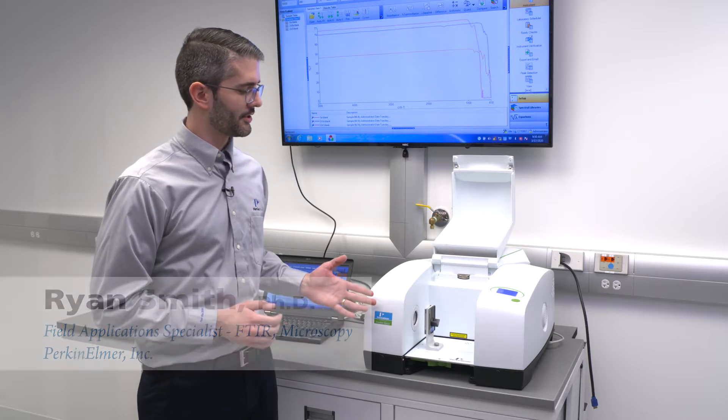Hello, my name is Ryan Smith and I'm an application scientist with Perkin Elmer. Today we're going to talk about the Frontier Optica.